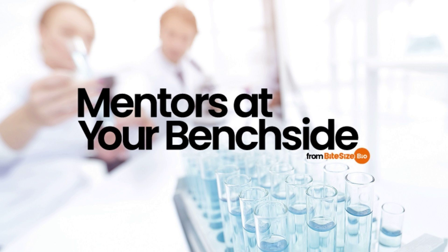The upper size limit of cryo-EM isn't really discussed in the scientific literature. It's generally assumed the sample size limit is anything you can purify, be bothered to solve, or can afford the computing power for. Thus, it's been used to solve the structure of dengue virus, which weighs about 11 megadaltons, plenty big enough. The lower size limit, however, is a hot topic.